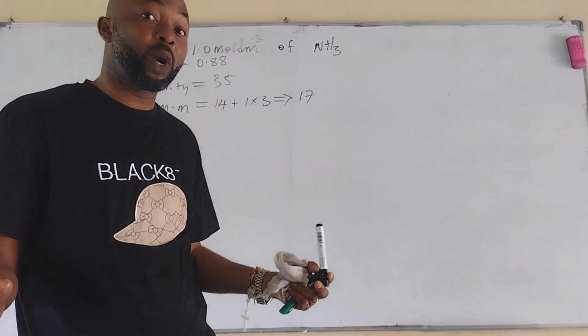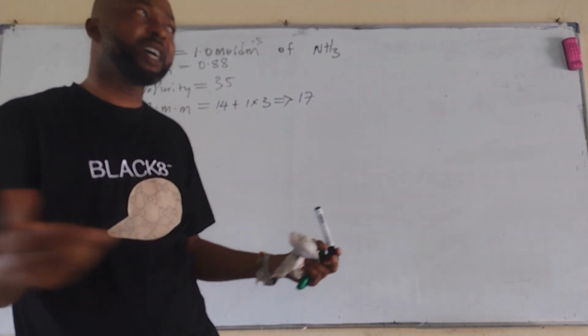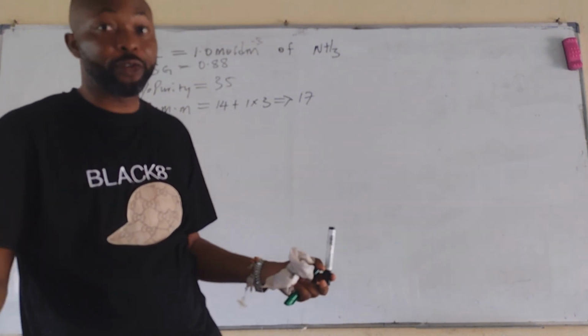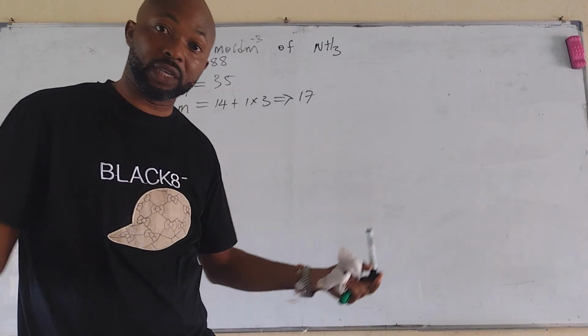You can use it while dealing with a base, provided it is in a liquid form, or whatever substance that is in a liquid form. Even mercury is in a liquid form. You apply this, use it.